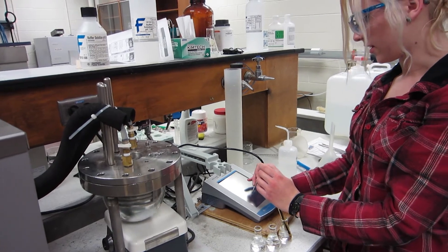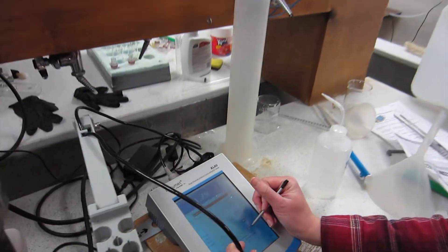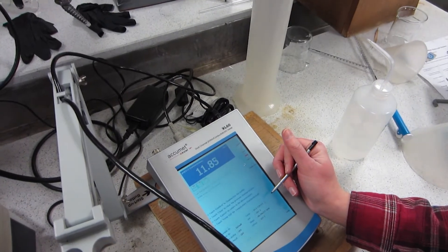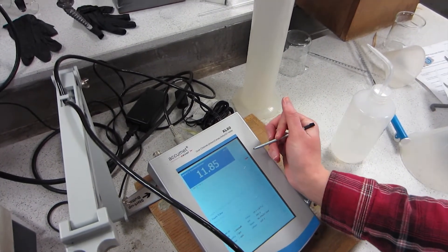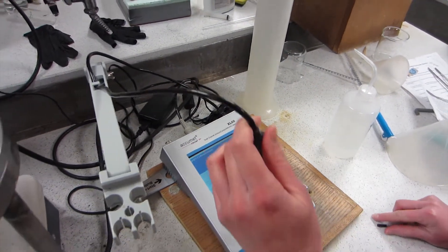Then hit confirm again. That's the 10 pH. So I entered that in, wait until it blinks at confirm, and now it's completely standardized and ready to go.